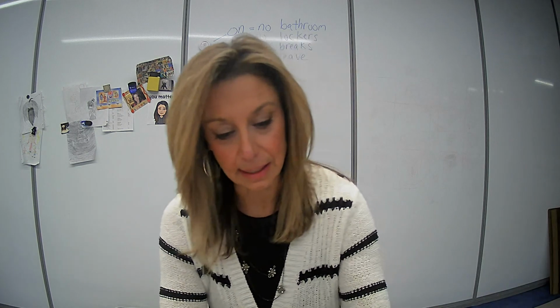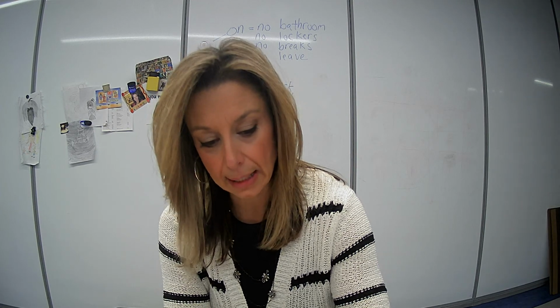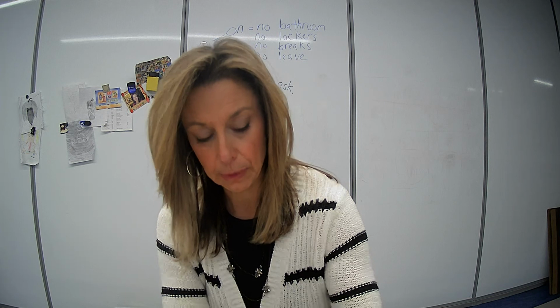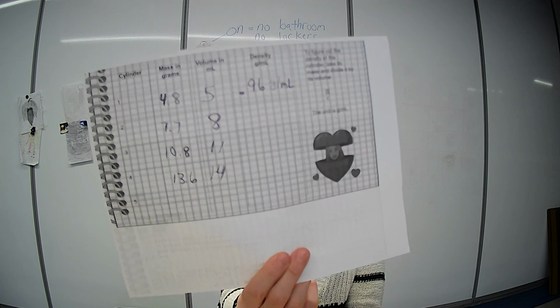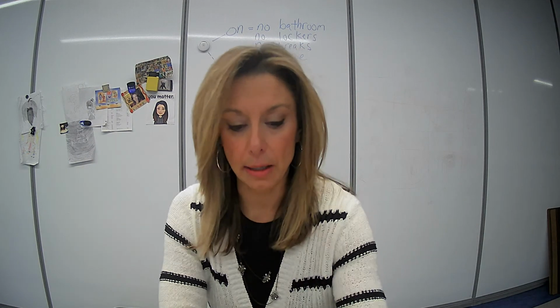So our density is not quite 1, 0.96 grams per milliliter.